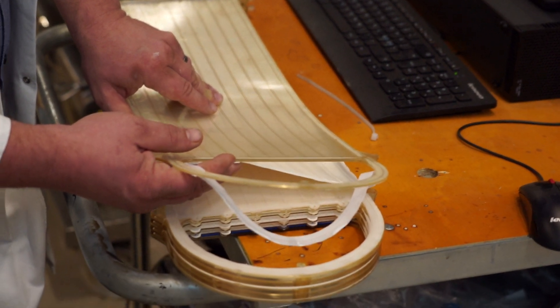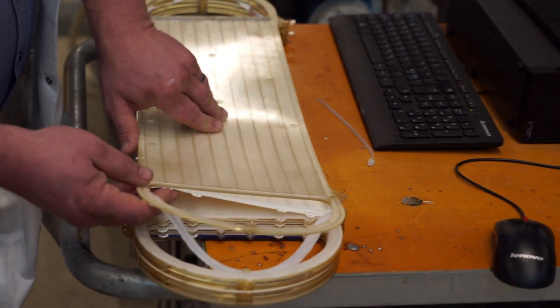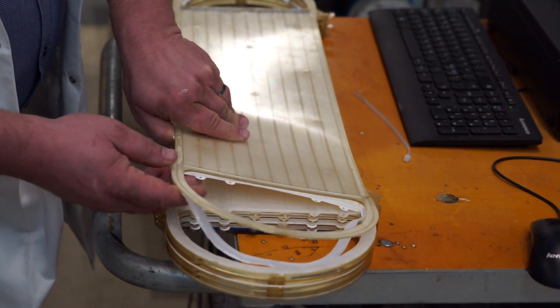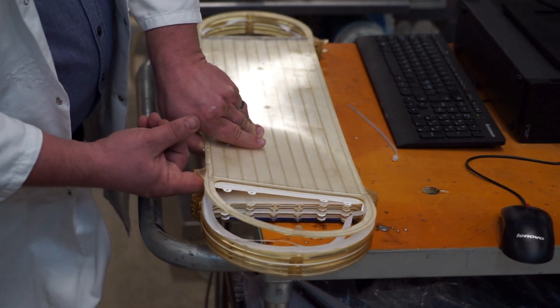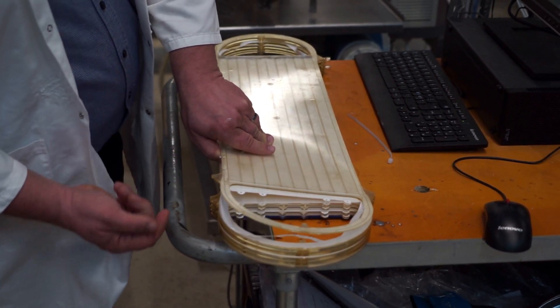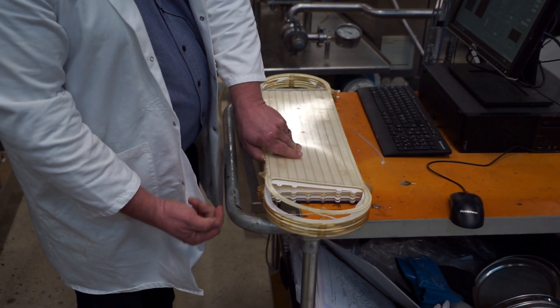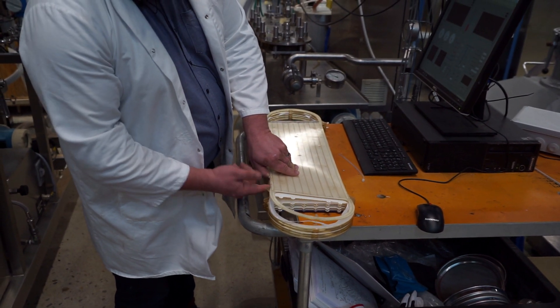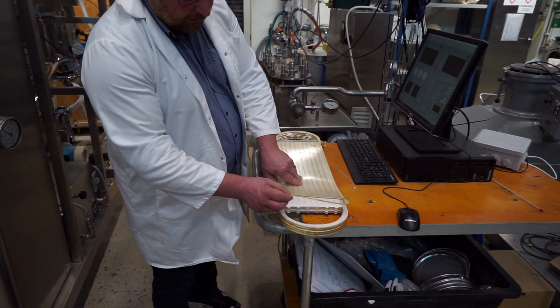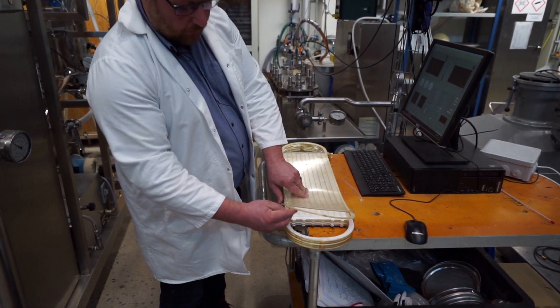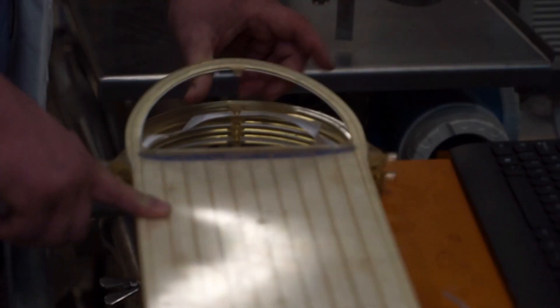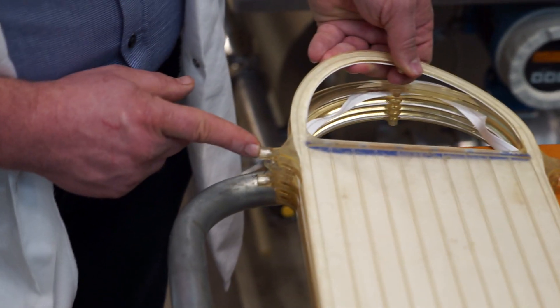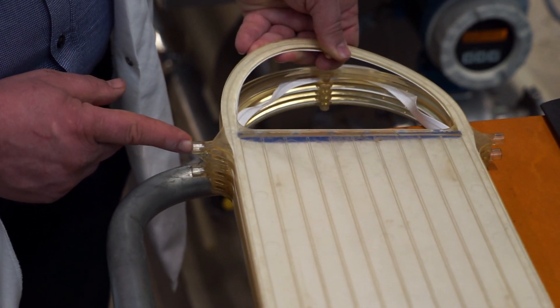So the pure liquid comes out somewhere, and the incoming feed comes in somewhere else. Exactly. The feed comes in through the end here, goes between the membranes. The solution that goes through the membrane goes into this plate. These plates are actually hollow. It's collected in these plates and sent out through this little hole here. This is where it collects.